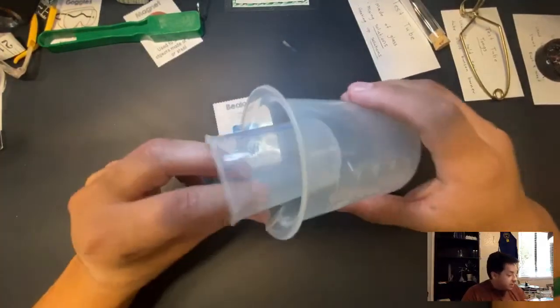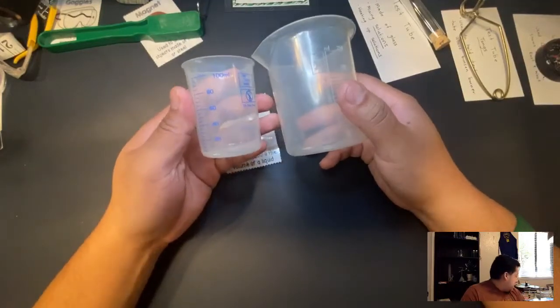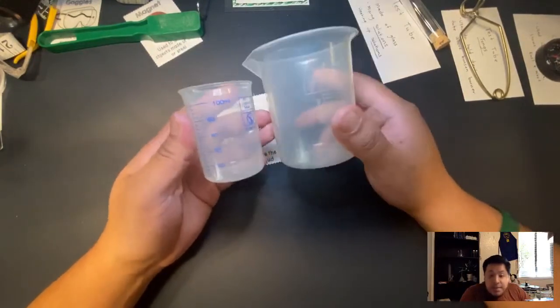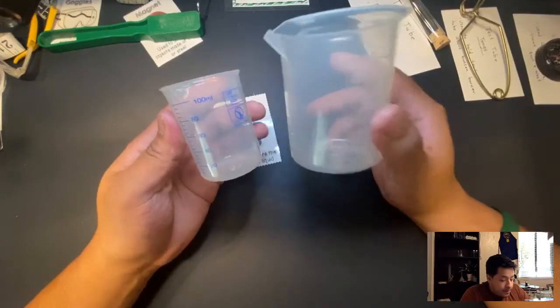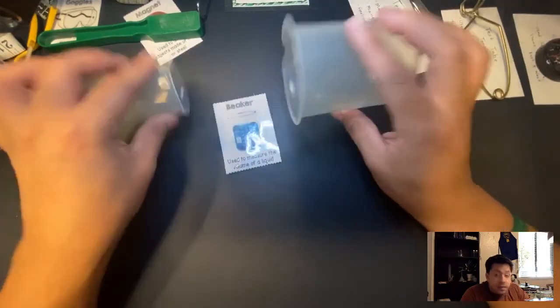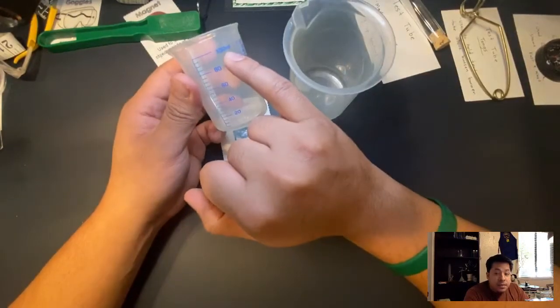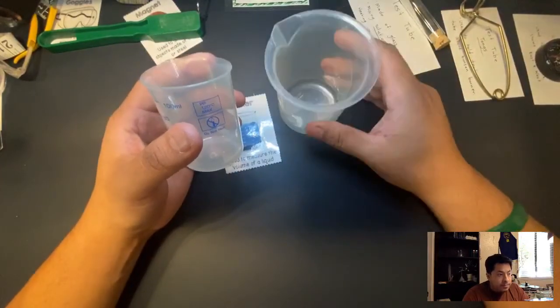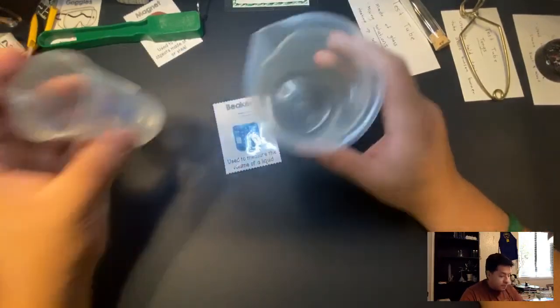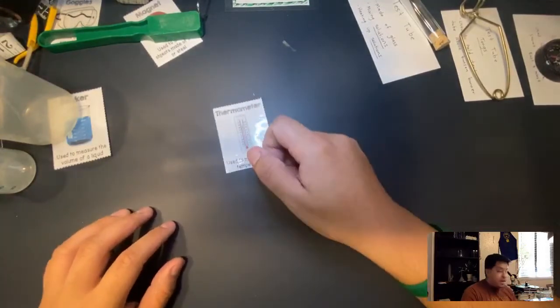Next is a beaker. Beakers are similar to graduated cylinders — they come in different shapes and sizes, and they can also be made out of glass. The two I have here are plastic. They have measurements and go by milliliters and liters, which is what we'll be using in the science lab.